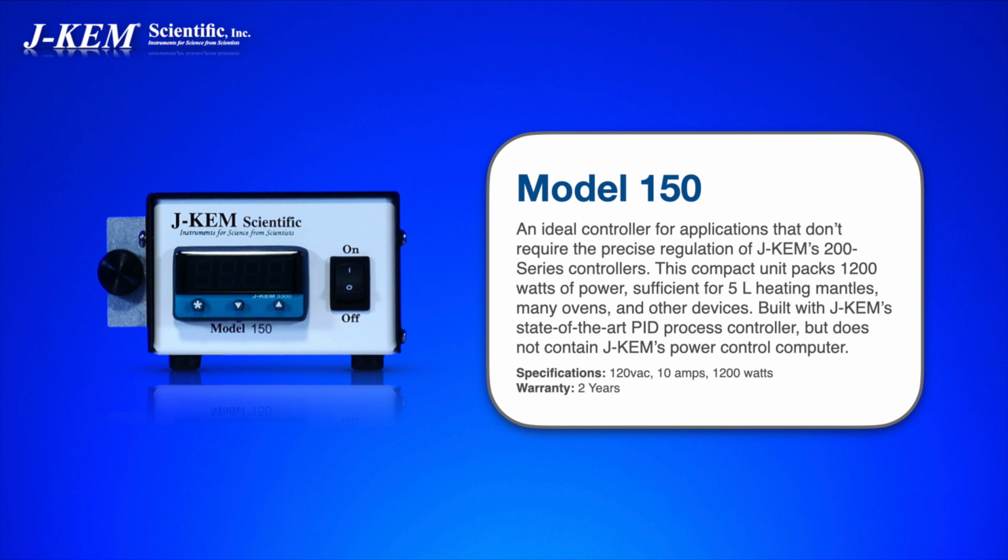Here's the key difference between our Model 150 controller, which is just the PID controller, and our research grade controllers, which have the PID controller plus our power control computer. The key difference is if you were heating a liter, the controller has time to watch it heat.